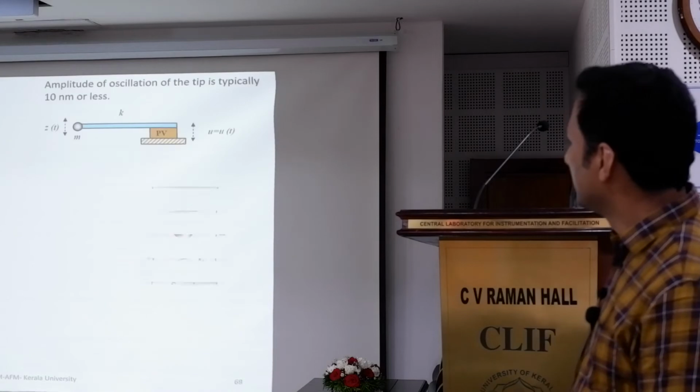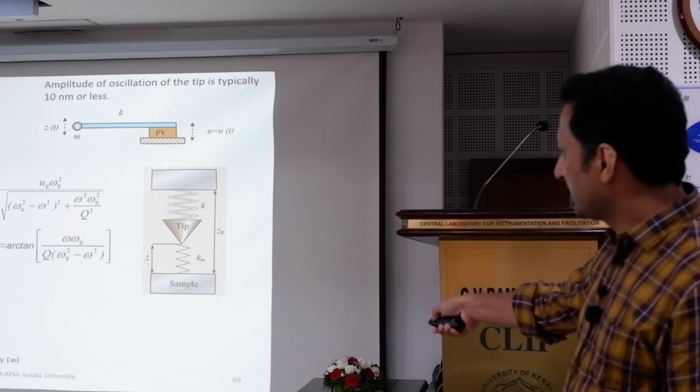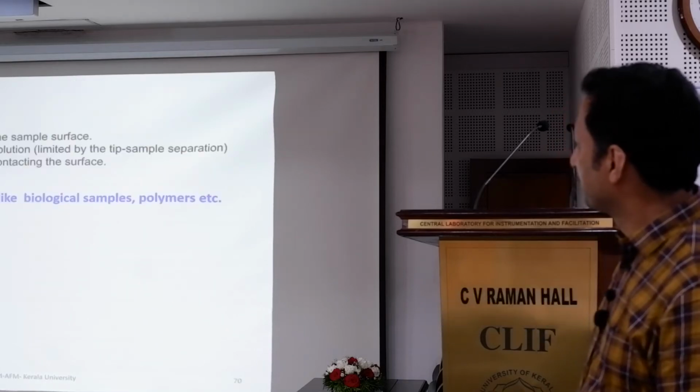Likewise here also. So you will basically get 6 images. Here also, amplitude variation, frequency variation and phase variation give you all these things.